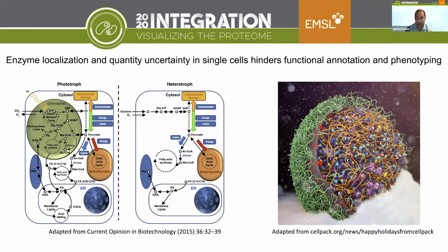Basically, for the EMSL user program, the development of visualizing the proteome, or visual proteomics, as we're calling it, is really about trying to provide direct experimental evidence to support each one of these, and also allow us to drive towards creating a simulated virtual cell.